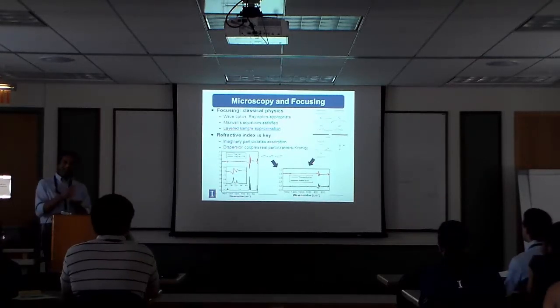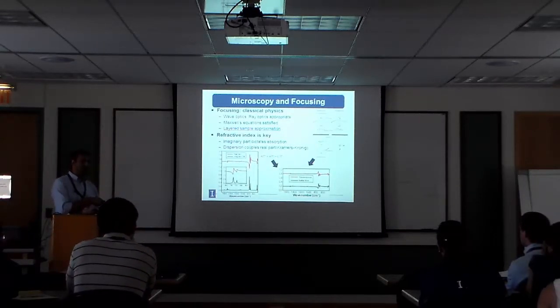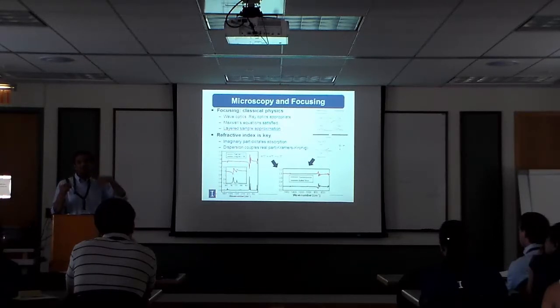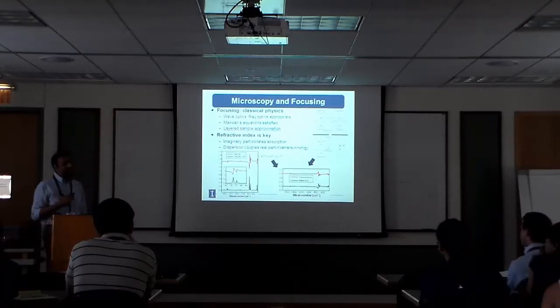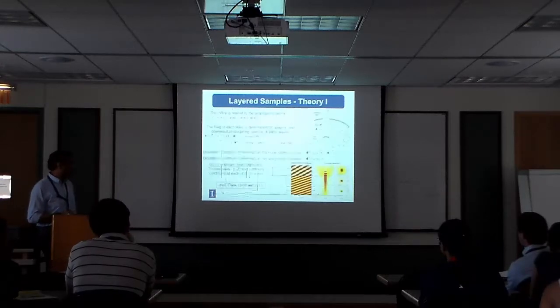Right? So precisely at the point where your signal-to-noise ratio is the highest, you also have the highest confounding effect. Light is absorbed based on this, but it is transmitted based on this. So light might have been absorbed correctly, but then because of scattering or because of mismatches in the real part of the refractive index or all the other factors that go along with it, it actually went somewhere else. So you didn't actually see light from where it was supposed to arise from, and that's really where the transmission function of the instrument changes when you put the sample in. Okay? And that can become quite large. It can actually become larger than the absorbance that you want to record, and that's the problem in this field.